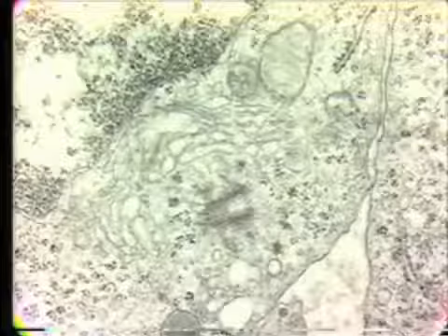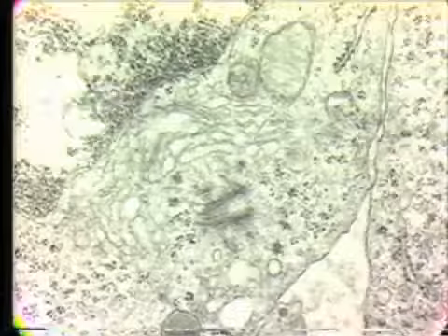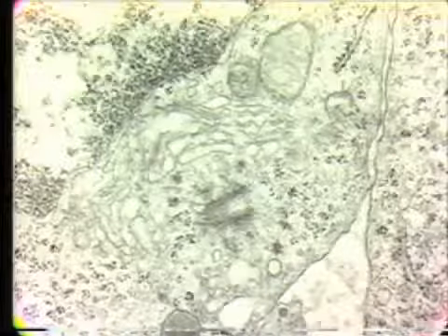Now, in this electron micrograph, there's a nucleus in the upper left-hand corner, and we can point to the nuclear membrane. Now, the Golgi apparatus is this vesicle and lamellar appearance of membranes. This is where the protein is condensed and packaged up into secretion granules.